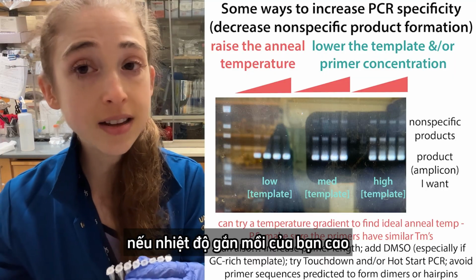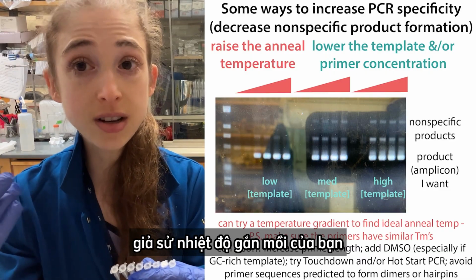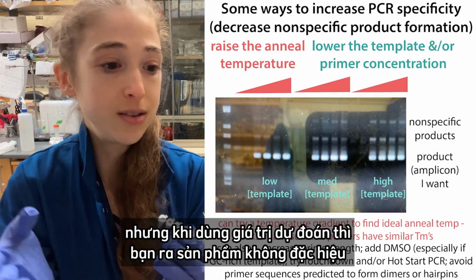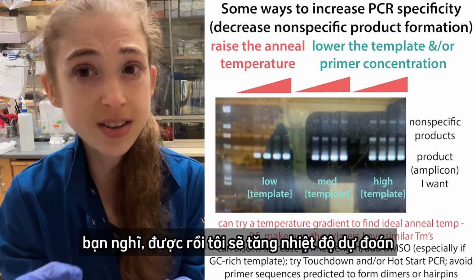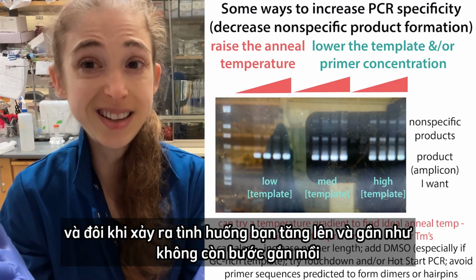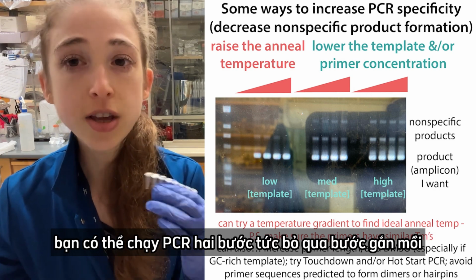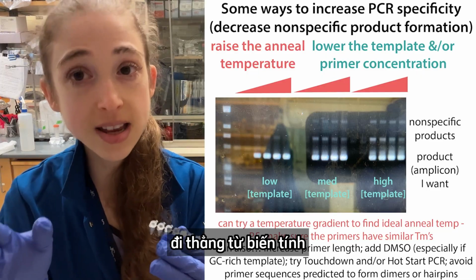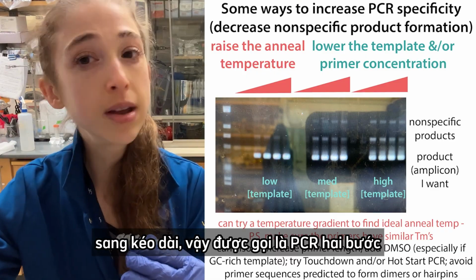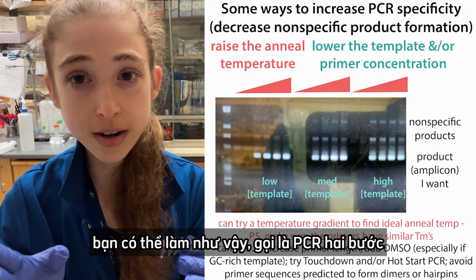Now, if you have a high annealing temperature, sometimes you can just skip that annealing step. So say your predicted annealing temperature, or maybe you found that when you use the predicted one, you get non-specific products, so you're like, okay, I'll raise it. And sometimes you raise it and your annealing temperature is the same as your extension temperature or something like this. You can just do a two-step PCR, so skip that anneal step, go straight from the melt step to the extension step. We call it a two-step PCR.